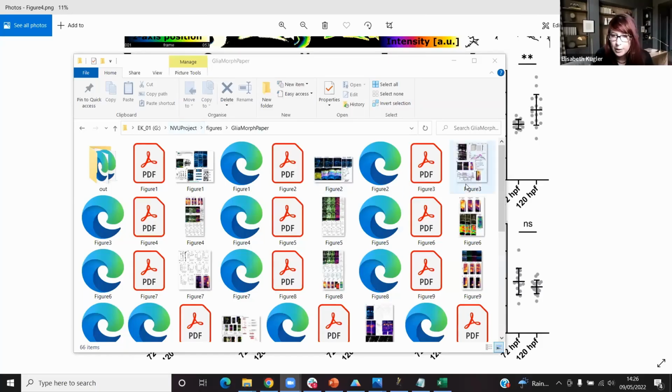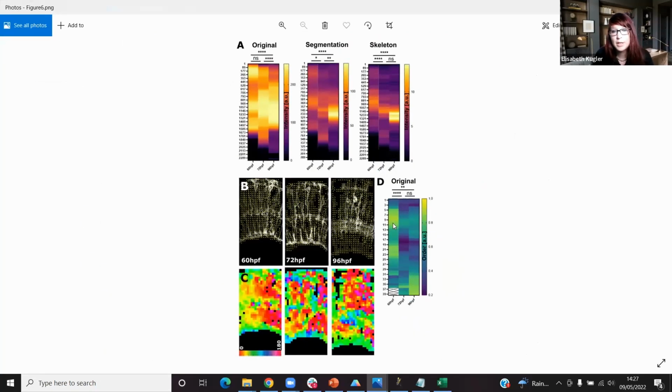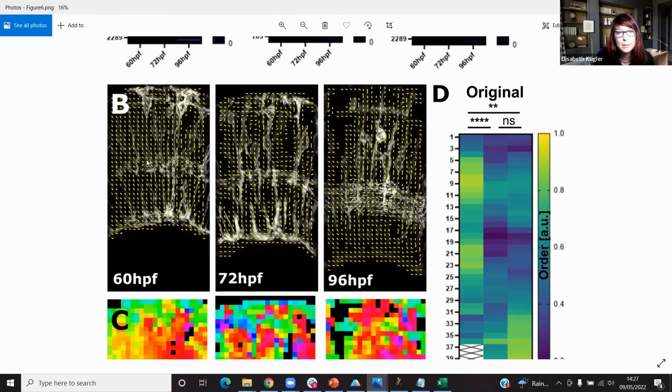Just share the screen again. So again, in the bioRxiv manuscript, we have looked at orientation, so it's not orientation of branching points but rather overall orientation. In this case, we use a tool based on the Fourier transformation, from Stefania Marcotti from KCL. This works on 2D data, but we wanted to know the alignment, because we know within this IPL we have our protrusions more aligned sideways rather than the overall morphology being upwards.